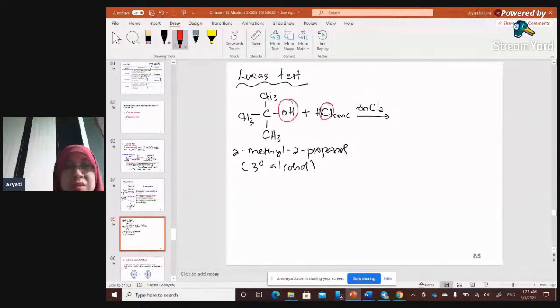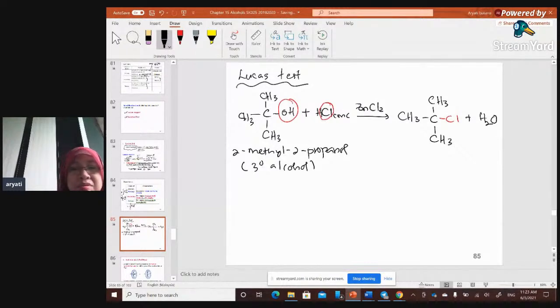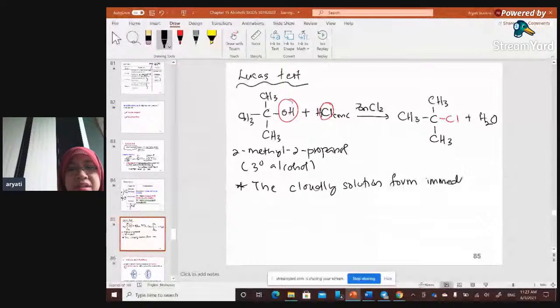Your product will be CH3, C, CH3, CH3, with Cl, plus H2O. Okay, so your observation is cloudy immediately.